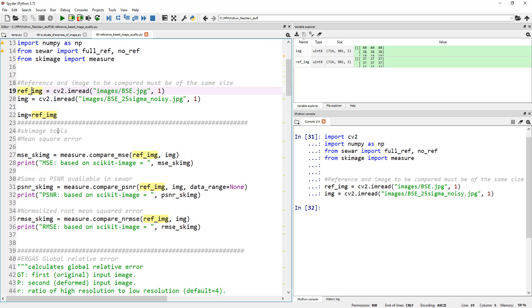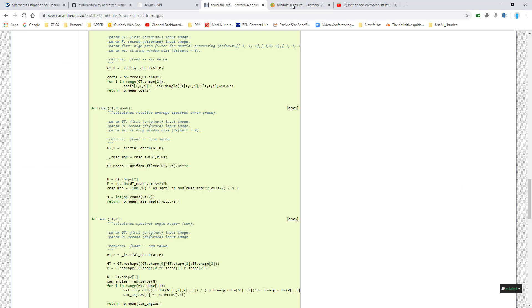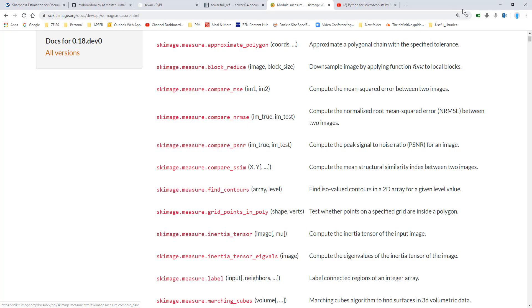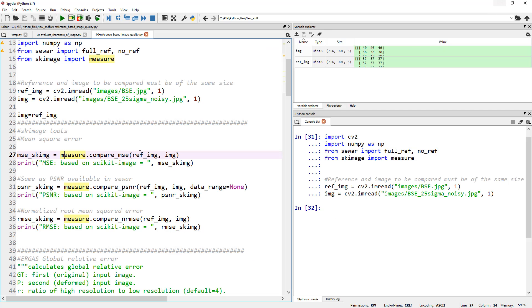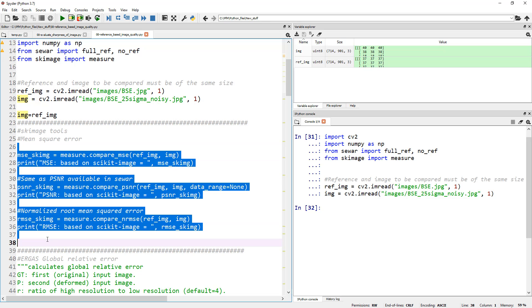So the scikit image functionality here, I'm importing the mean squared error from measure, right? This is the one we saw as part of scikit image, compare MSE, compare NRMSE and PSNR and so on. So all I'm doing here is mean squared error, normalized root mean squared error and peak signal to noise ratio. And then the first image is the reference image. Second one is the one that we are comparing against the reference. And let's go ahead and print these values out to get a quick understanding of exactly what's going on. So let's run these lines.